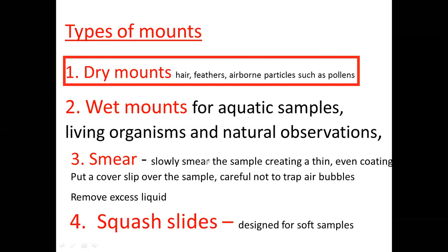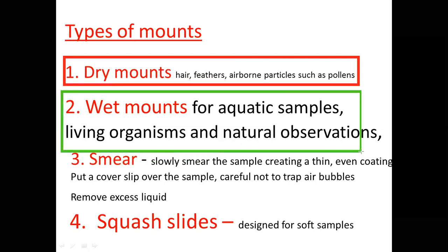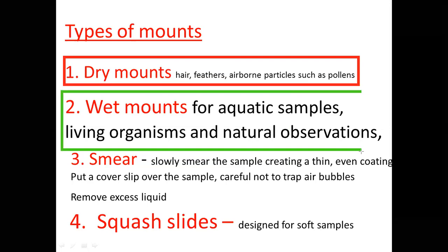The 2014 one was a very interesting one. It was a wet mount, mainly used when you're dealing with aquatic samples. In 2014, we just picked our sample from the broth that was respiring. We had a mixture of glucose and water and yeast, and it had actually been fermenting for some 15 or 20 minutes. Then we had to pick our sample with a dropper.